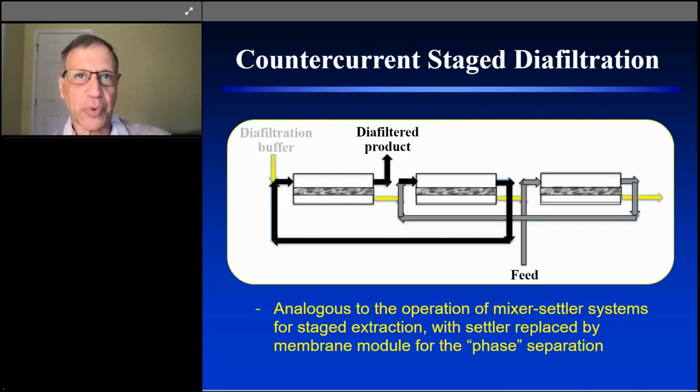Each of the modules allows us to remove some of the penultimate buffer components, eventually getting to the desired degree of diafiltration, but we effectively reuse the buffer so that our overall buffer requirements are kept quite low.